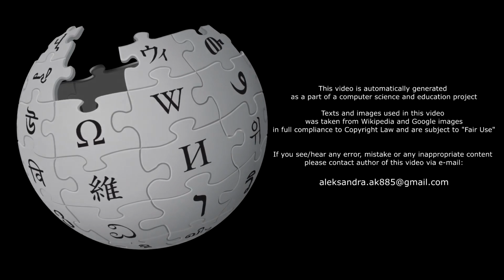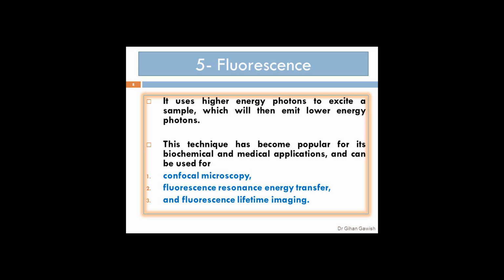Fluorescence-lifetime imaging microscopy, or FLIM, is an imaging technique for producing an image based on the differences in the exponential decay rate of the fluorescence from a fluorescent sample. It can be used as an imaging technique in confocal microscopy, two-photon excitation microscopy, and multiphoton tomography. The lifetime of the fluorophore signal, rather than its intensity, is used to create the image in FLIM. This has the advantage of minimizing the effect of photon scattering in thick layers of sample.